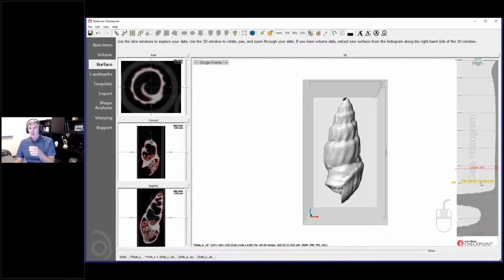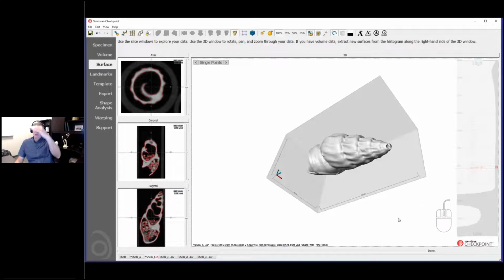And the reason you want to do that is because as you change that ISO value, it's a density value with respect to your volumetric data. So remember the topography example of the height of mountains and that kind of thing. If you're changing that value, you're changing literally the height value within that function. And so as you move the height up and down, that's going to change how those lines circumnavigate that mountain. That makes sense.